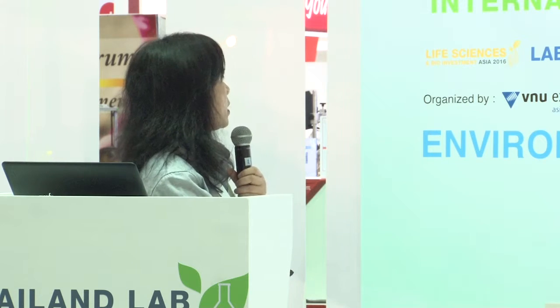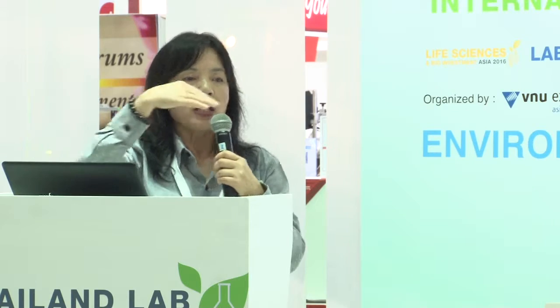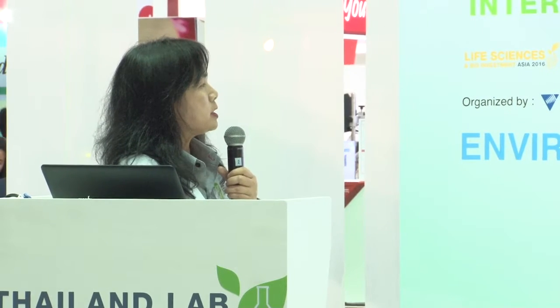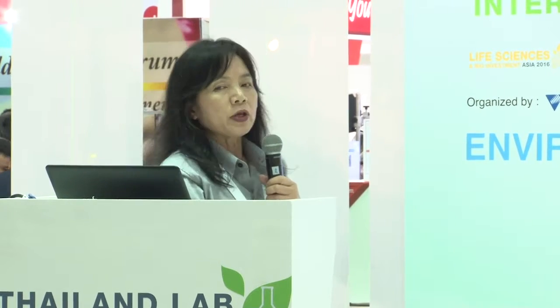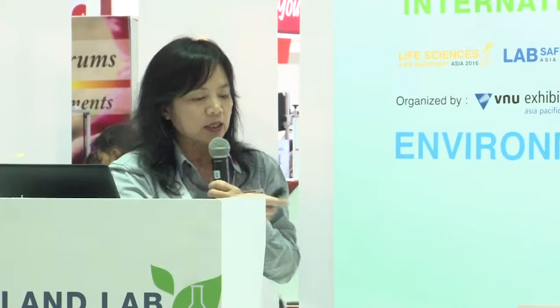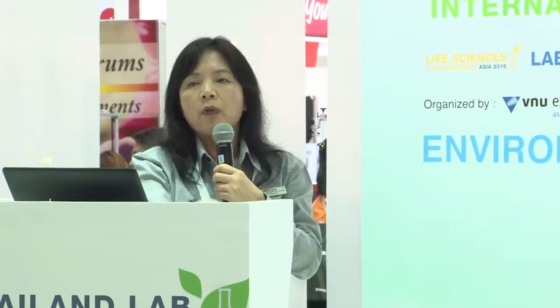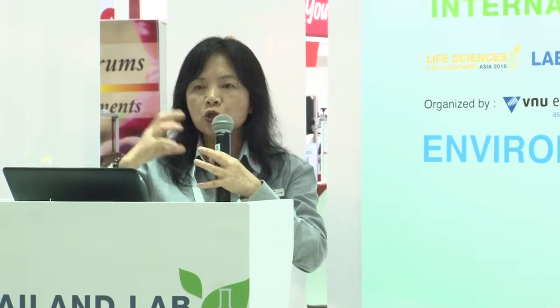Alright, so the next one is about the optics, right? The ion beam comes through, and it turns 90 degrees into the quadrupole. So we have an ion mirror here. This is called the ion mirror. When you hear the word mirror, you think it's a mirror we use every morning for makeup. It's not. It basically is a piece of bare stainless steel, and we apply voltage to control the ion beam going through.